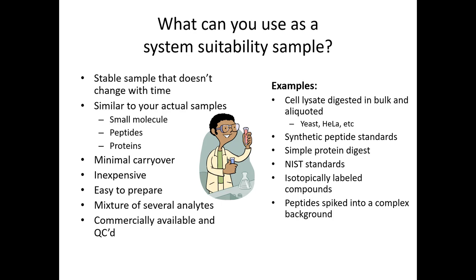But yes, does that answer your question? Degradation? It does, but I think, depending on which vendors we purchase these reagents from, sometimes they are not always consistent. Sure. So that's where, and of course users have their own way of making these things, so if we make it in bulk, that always may not work out.